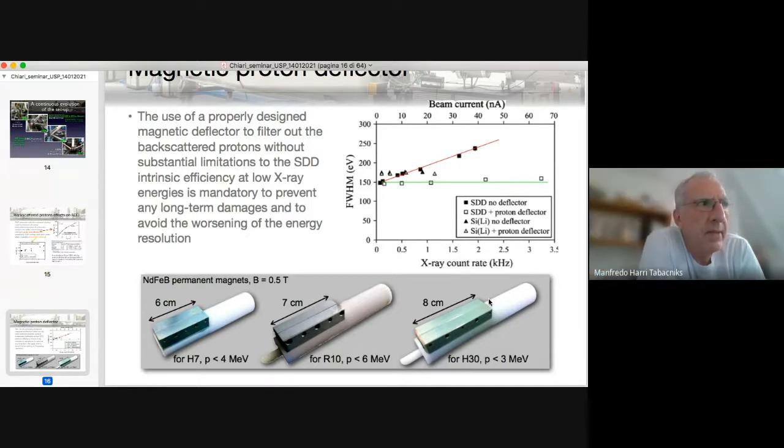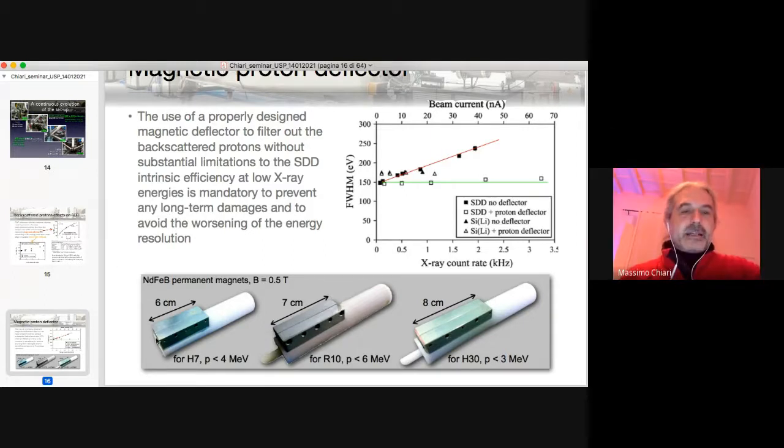Can you show more or less the magnetic field lines? The field lines are in this direction. They're perpendicular to the path. So you have a deflection. We are not taking into account the fact that the beam has a divergence. We are not taking into account the fact that here it is not in vacuum, it is in air. So the beam is indeed slowing a little bit, maybe a second order effect, while it is traveling. So it will be diverted more at the end of the deflector than when it's entering.